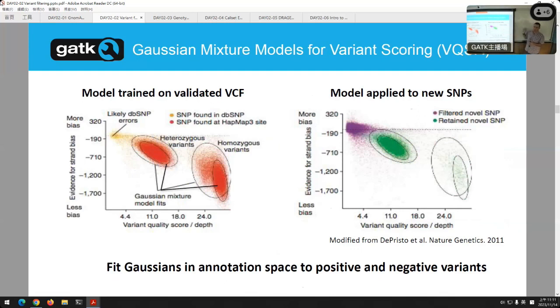Okay, that was a side point. But the important point here is that we need to set those thresholds between what are clearly bad and clearly good, and they kind of bleed into each other. Sometimes it's hard to see that dividing line.